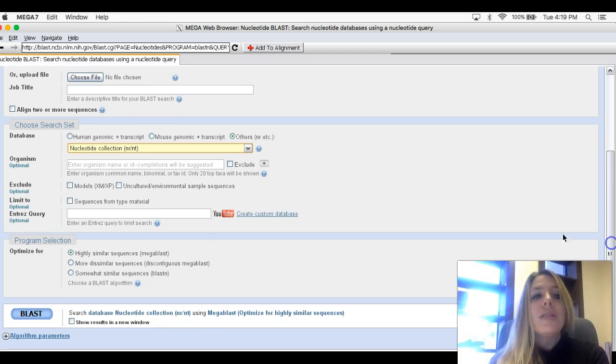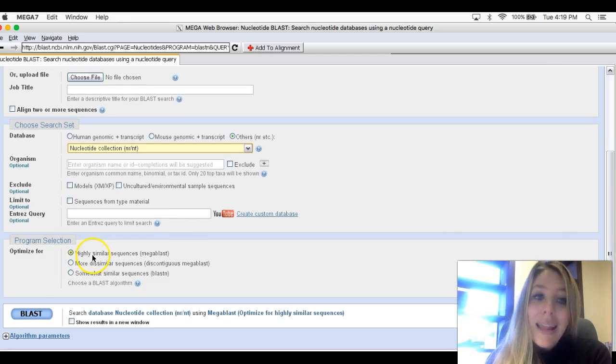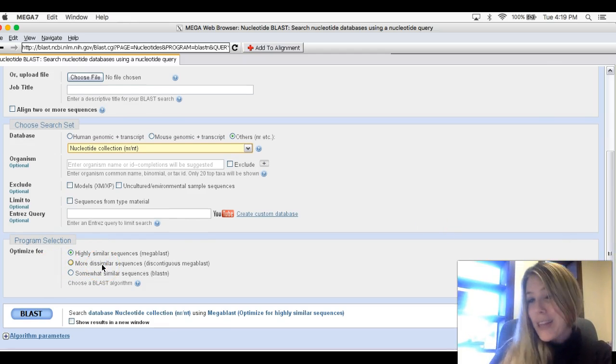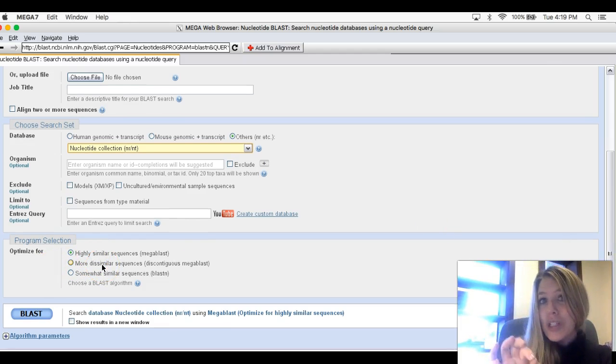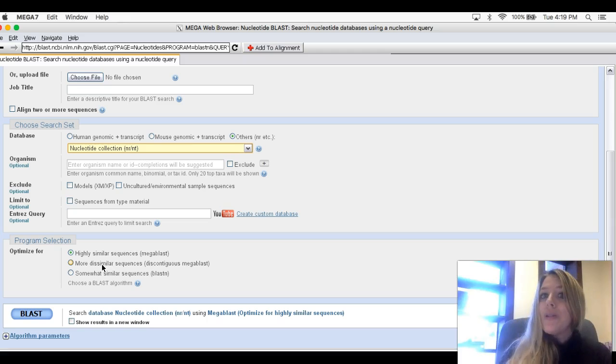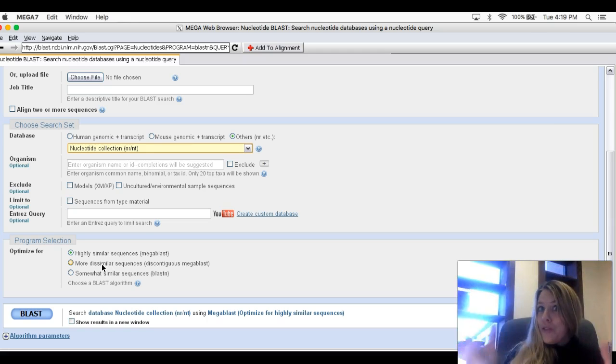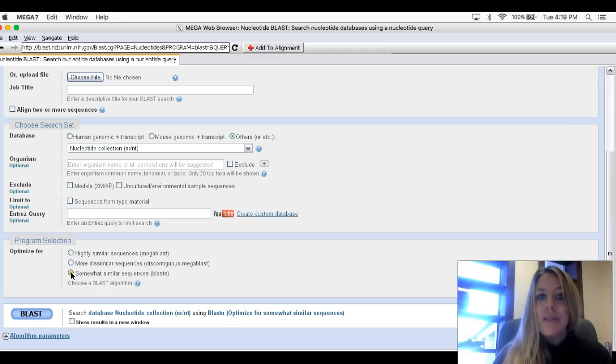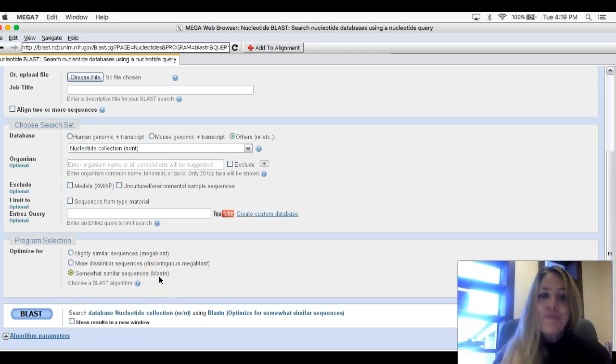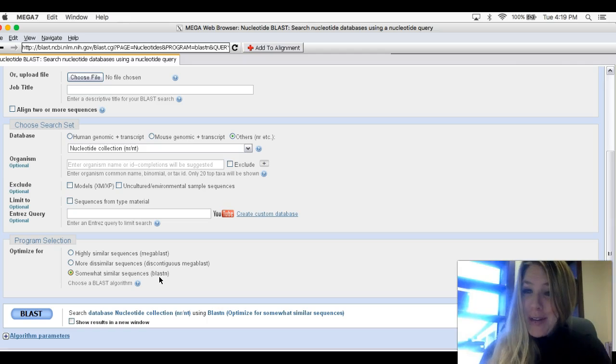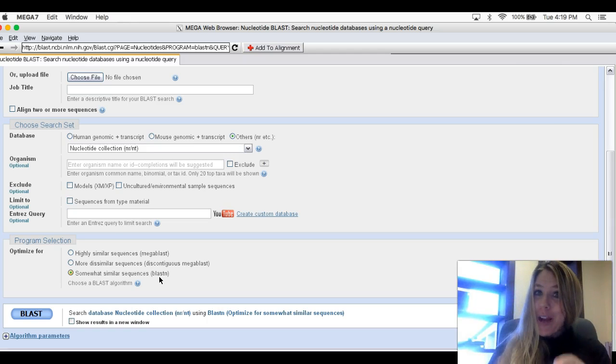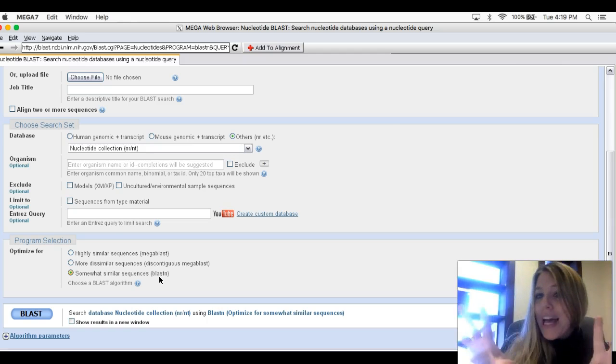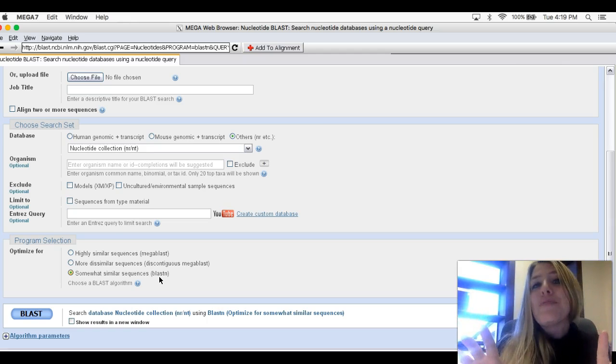Notice here it says Highly Similar Sequences. You don't want that. It's too stringent. We want to allow for room for evolutionary change. So we're going to click on Somewhat Similar Sequences or Blast In. Once those checks are done, we are ready to blast.